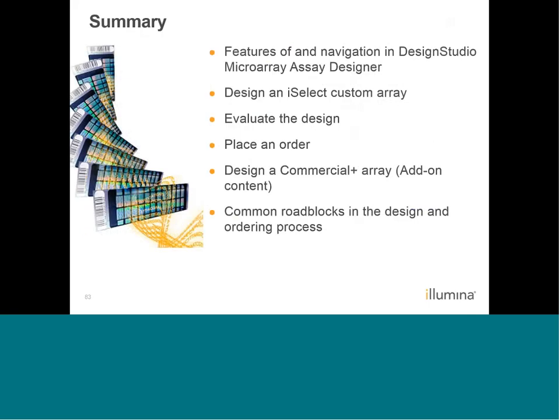So to summarize what we've talked about today, we've looked at the features of and the navigation in the Microarray Designer. We designed an iSelect custom assay. We evaluated that design, and again, I want to emphasize that that's an iterative process. You just keep looking at the designs, making sure all of your targets are included, making sure that your targets meet your experimental needs. We showed you how to place an order. We also talked about designing a commercial plus array because there are some parts of that process that are different from designing a straight, fully custom iSelect array. And finally, we talked about some common roadblocks in the design and ordering process.